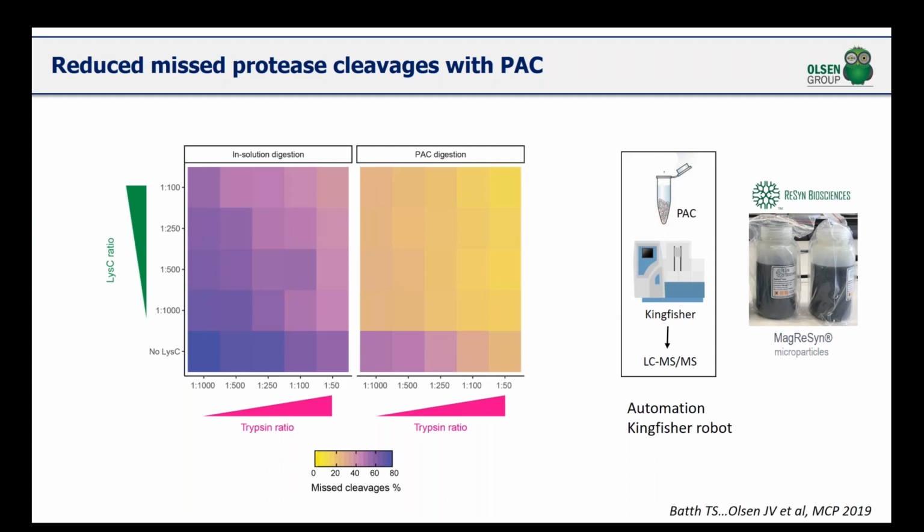And more importantly, we can automate this whole digestion procedure in the KingFisher robot using the magnetic beads from ReSyn Biosciences.